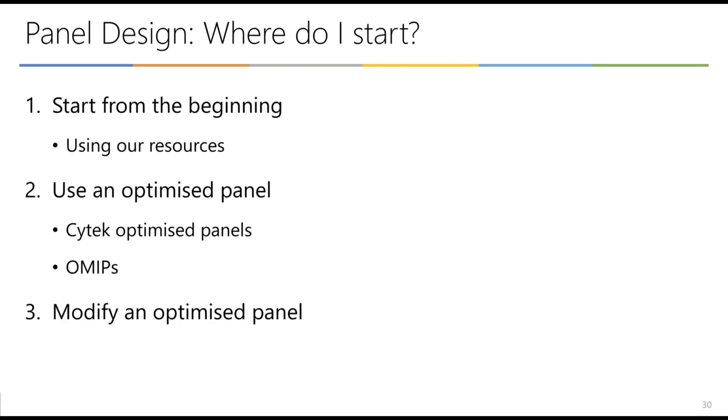So now you're keen to start on your own panel design. What options are available to you? Well, there are several ways for you to approach panel design. You can start from scratch and build your own panel. And don't forget all those resources that I've mentioned, which are available to you.